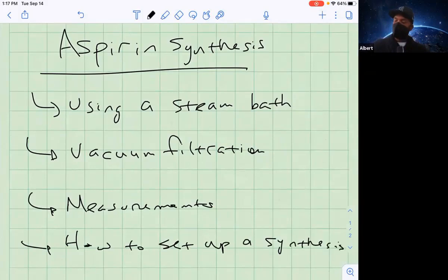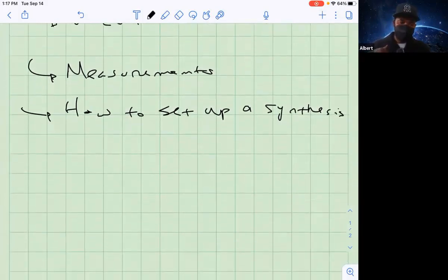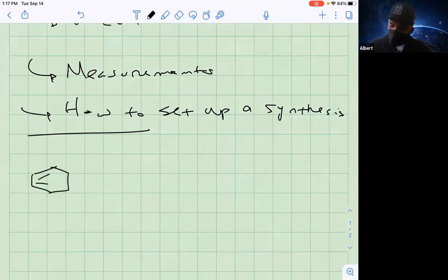All right. So with this aspirin synthesis, if you downloaded the data sheet, the reaction scheme is up top, right? You should have filled out the reagent table, and if you haven't already, you'll have time today. We're going to actually look this up even before we start. So we're going to take salicylic acid, which looks like this.